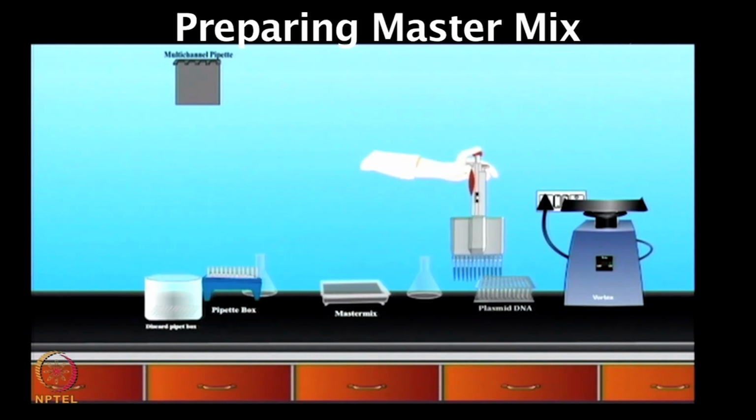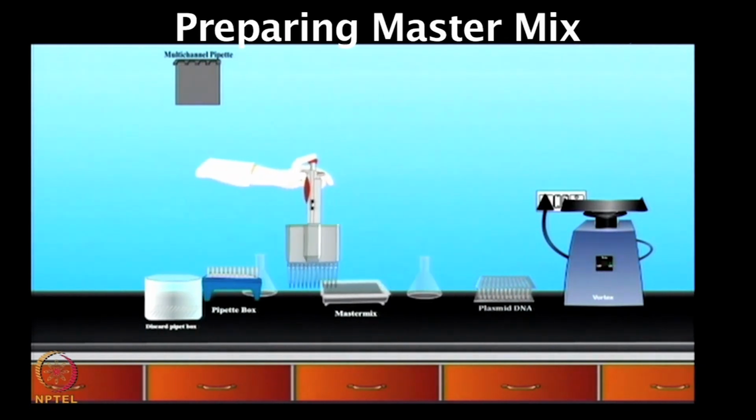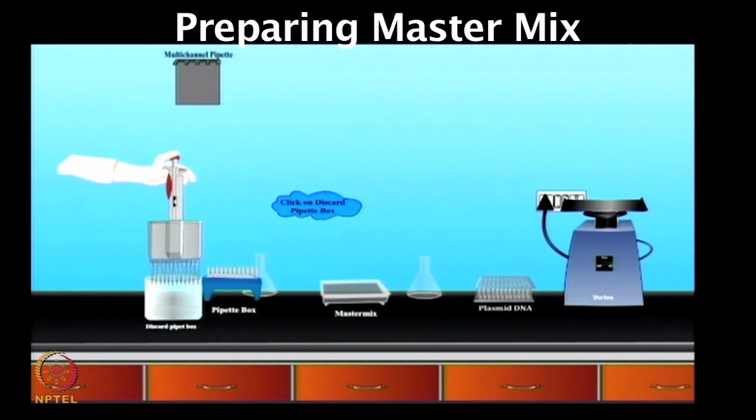Once the master mix is added to all the wells in the block, you need to shake the plate for 15 minutes.